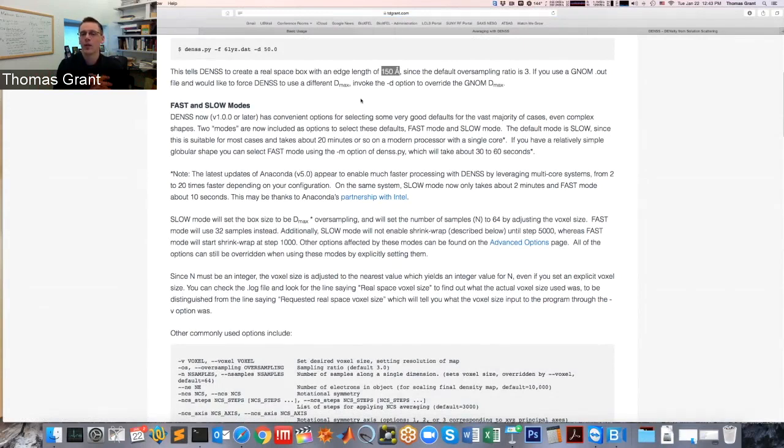And so you'd end up with a voxel size of something like 2.4 angstroms, whatever 150 divided by 64 is. Because it's 64 cubed, you have that many voxels. And so the speed goes not quite, but almost as the cube of the number of samples. It's actually n log n cubed, or whatever that Fourier transform equation would be.